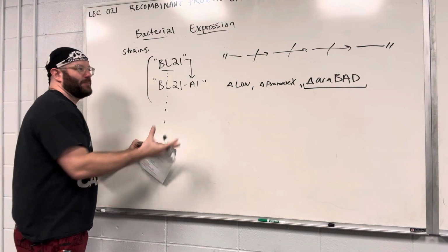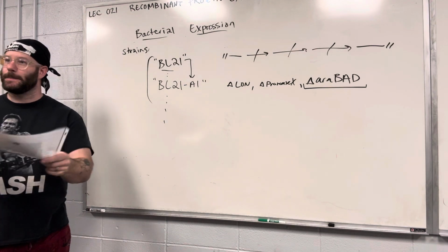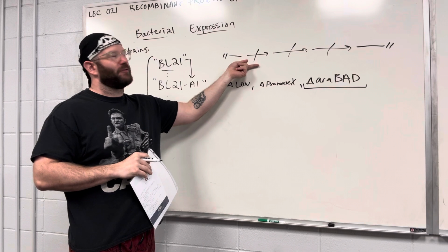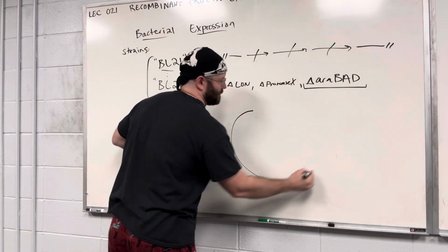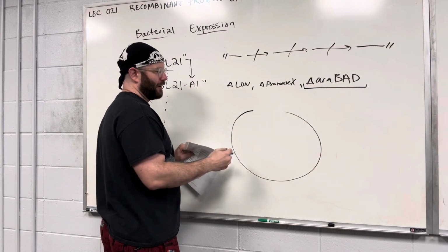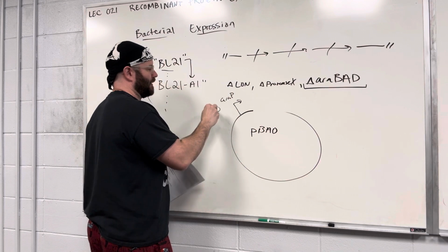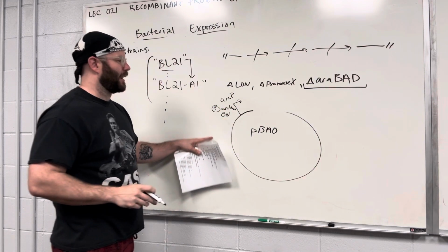This connects directly back to the plasmid selection. That way it'll want to take up the plasmid that you insert. You're saying they would want to take up the plasmid? Well, having the arabinose operon will not prevent them from taking up another plasmid that has an arabinose operon. So let's review, what's the plasmid that actually has the arabinose operon? pBAD? Yeah, so there's this pBAD plasmid, which is quite popular. It's got a promoter, the araBAD promoter, which remember you add arabinose and it turns it on.